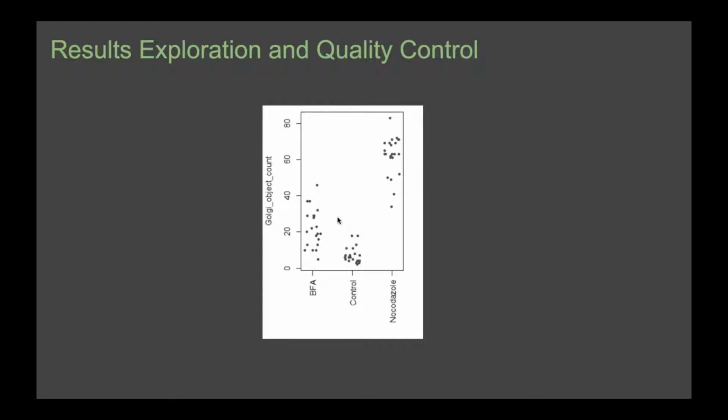So there's registration. I think yes, it's a big thing also in biology, but it's also interesting that you mentioned medical, because in fact I was looking around for what's the best software to do that, and it comes from the medical community, I think, and unfortunately it has a very similar name to the software before. It's called Elastix. So not ilastik, but Elastix, and that comes from the medical field, but I use that a lot now for biological data also.